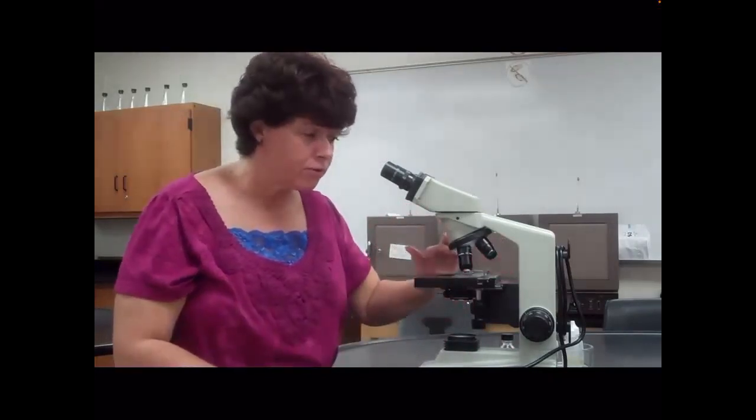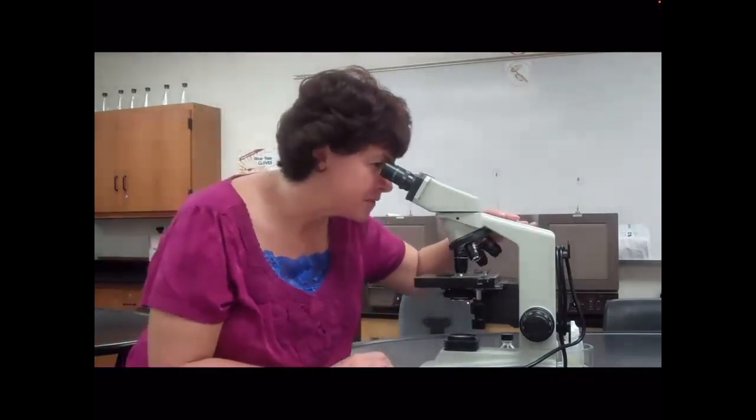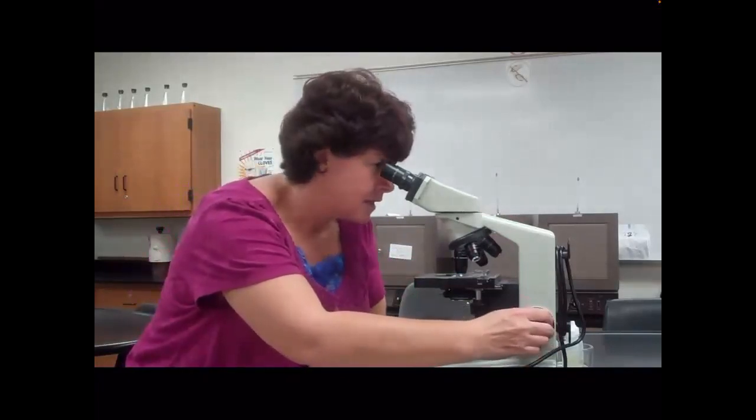Now that I have the oil on there, I want to take a step back. Do you notice I did not move the stage? I did not move the slide. If you are focused with the 40, it will work with the 100. Make sure that it is absolute focus and it is centered on the slide before you put the oil on. It's kind of like the point of no return. So then I clip the 100 into place. So now I see it. It's a little bit blurry. Find focus. So I find focus and it comes right in.